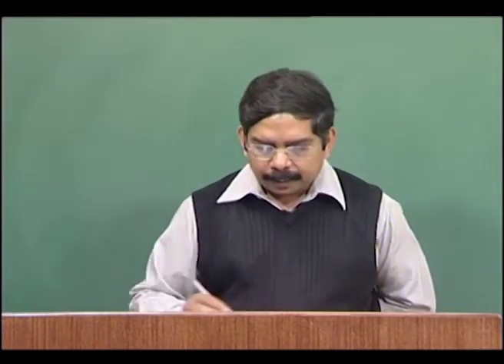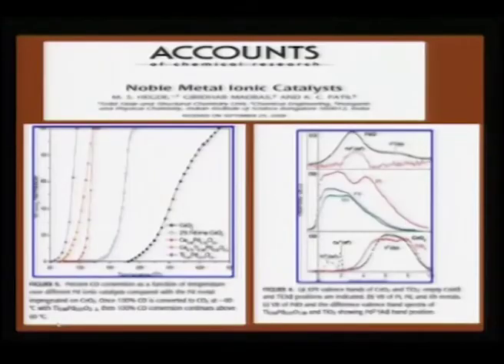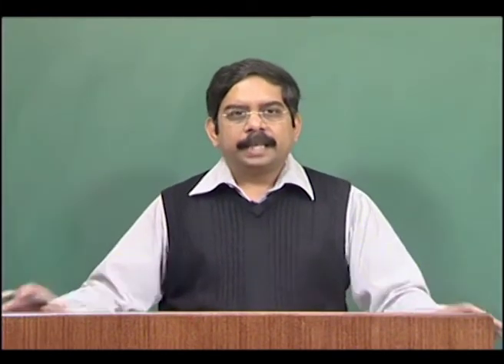So, XPS is a very useful tool, therefore, to provide the mechanism in a much more elegant way, and this is another example which I will be talking about in module 1 under combustion synthesis, where noble metal ionic catalyst has been proved to be existing. Because if you think of any catalyst with noble metals like platinum on silica, platinum on ceria or platinum on alumina, it is always recognized that these noble metals are in zero valence state, and that is why they show very high efficiency in converting the effluent gases in automobile exhaust.